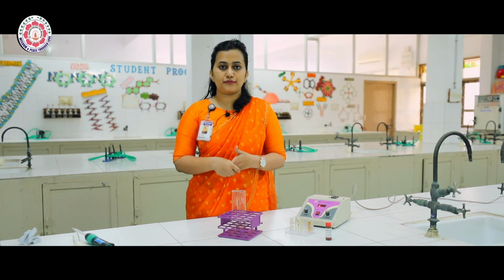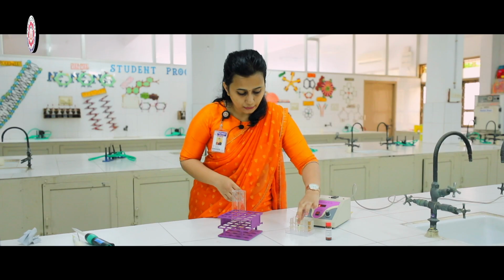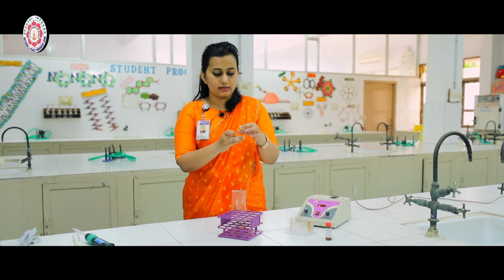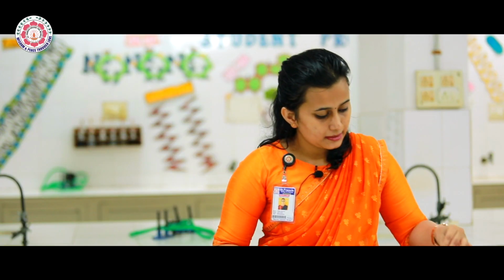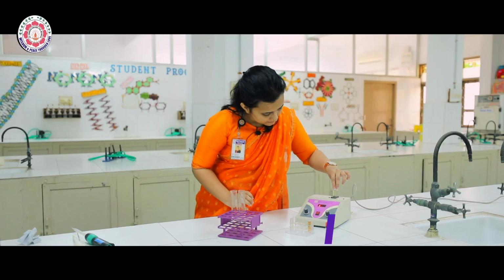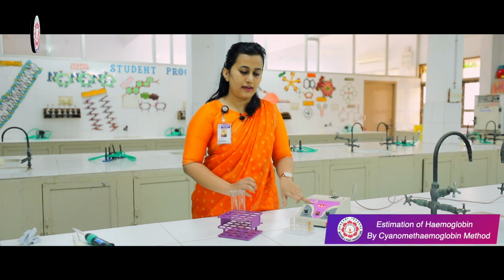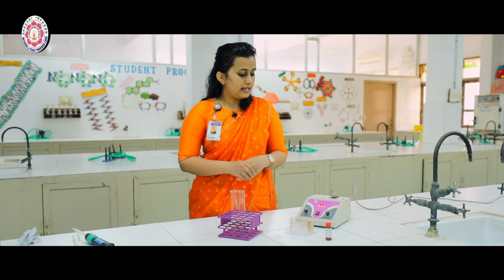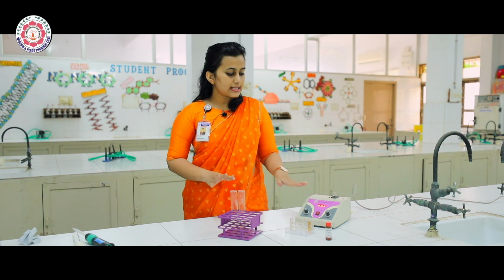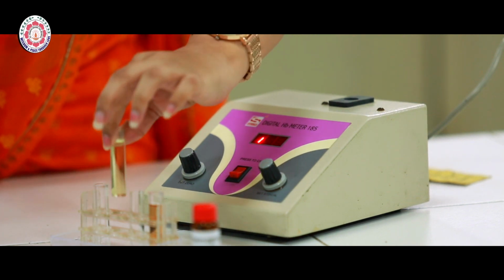After 5 minutes of incubation, we will be using a hemoglobinometer to estimate the color that was produced. The first step is to take the blank. I've already taken this blank into the cuvette. We place it in the slot and we set the value to 0. Once you see a 0 on the screen, it means the instrument is calibrated. You can now take out the blank solution.